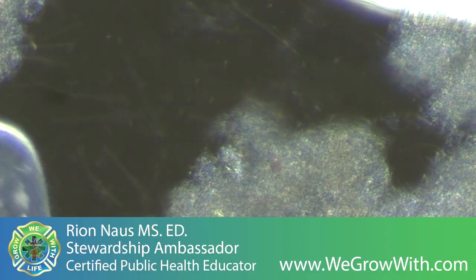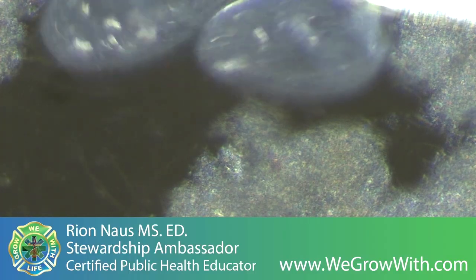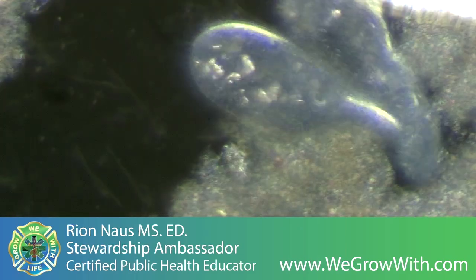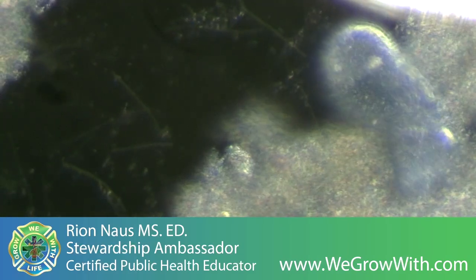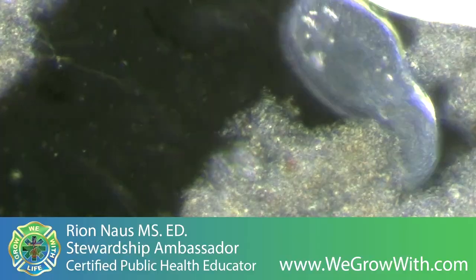And depending on the type of organism that it is, that preservation of life is a tun state if you're a tardigrade, or a cyst state.